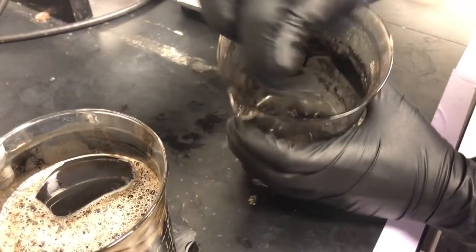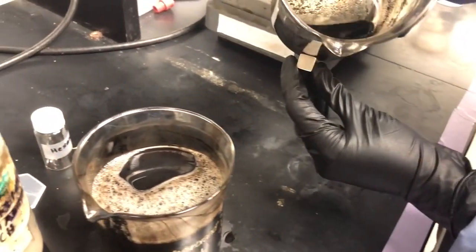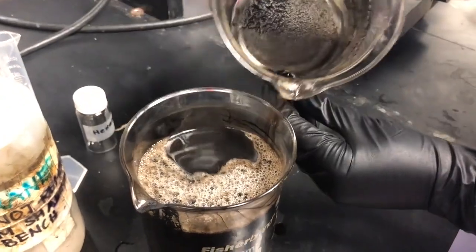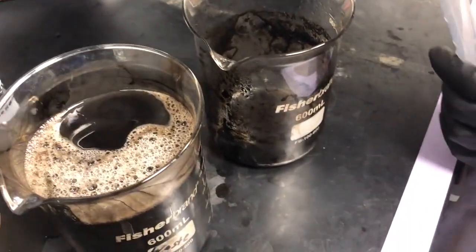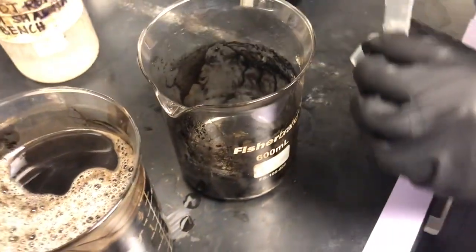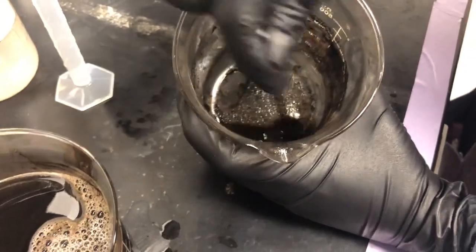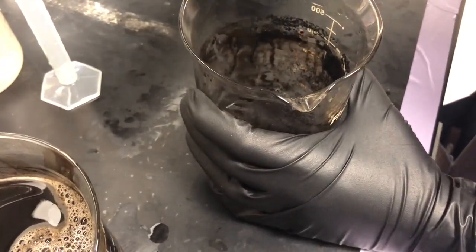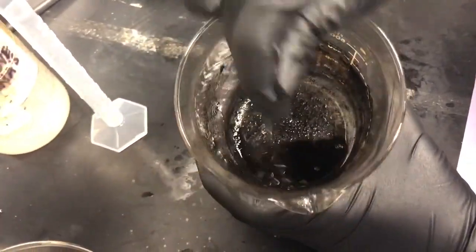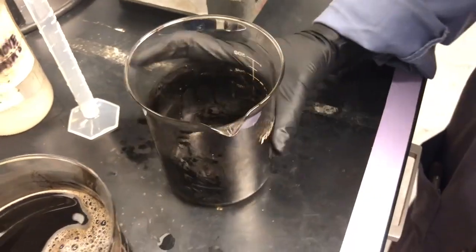Alright, so we've got our final wash. Again, magnet, and just dump out the solution. Okay, now, of course, we need to get rid of the ethanol. So we'll do a hexane wash, and just like the water was removed with the ethanol, the ethanol is now going to be removed with hexane. Again, mix it, get the hexane in contact with all the nanoparticles if possible. Then the magnet, and we'll dump out the solution again, collecting the nanoparticles.